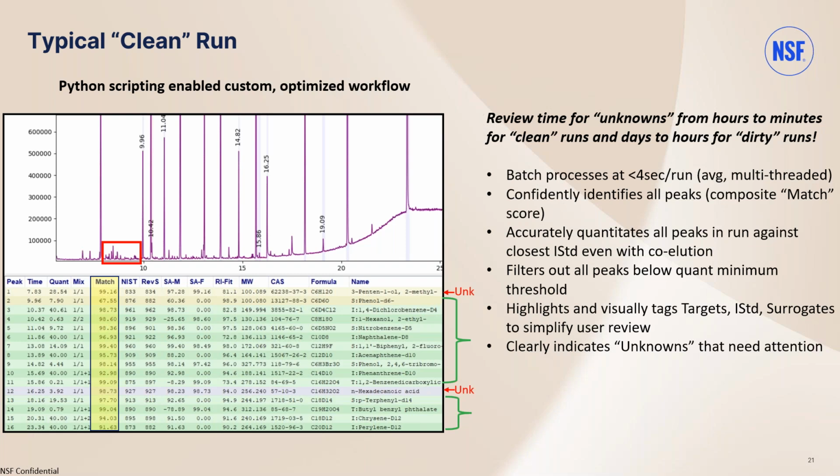And so you can see, after this file has been processed, the analyst now only has 2 peaks that they have to actually look at. And once they've determined whether these assignments are correct, they can easily export a LIMS file or a file to upload the data into our LIMS system.